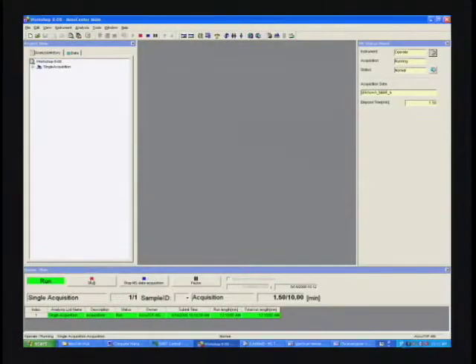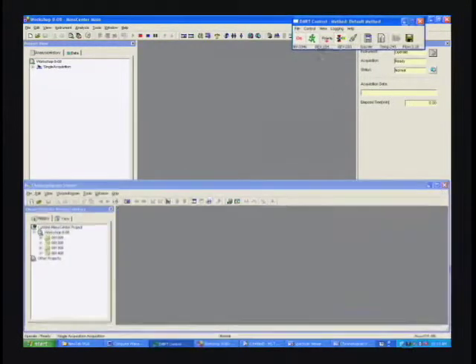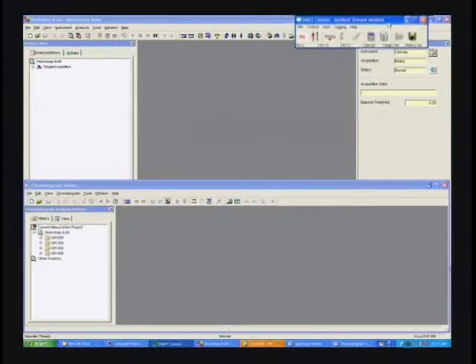We'll go ahead and stop the analysis by pressing the red stop button. And we'll set the DART back to standby mode. That just leaves everything heated up and purging with nitrogen, but it shuts off the helium and the high voltages, just to conserve helium and set things into a mode that's ready to go again.